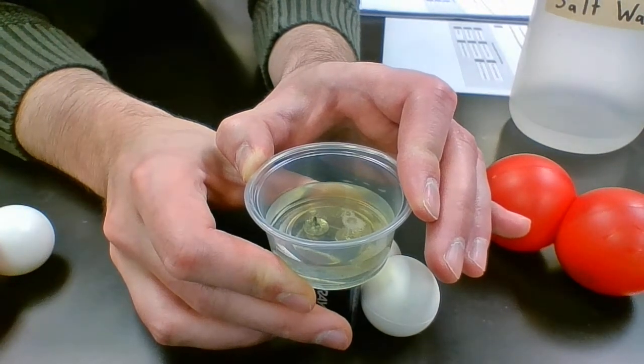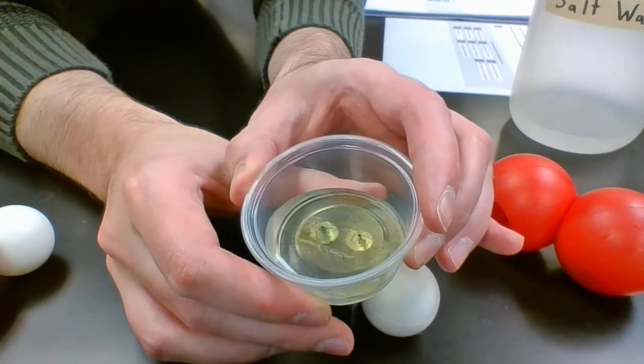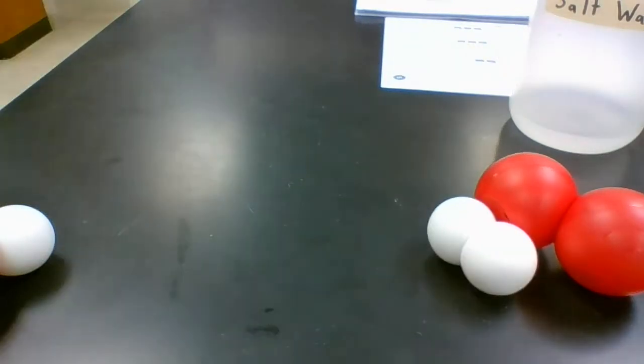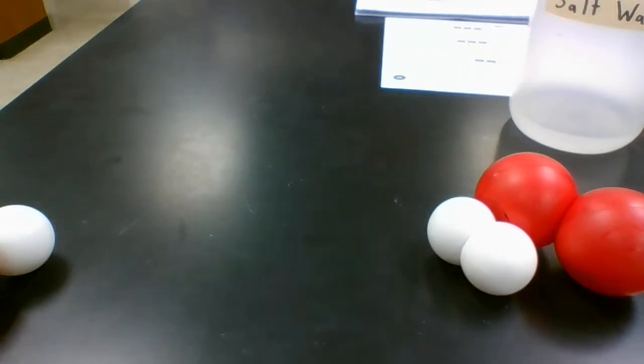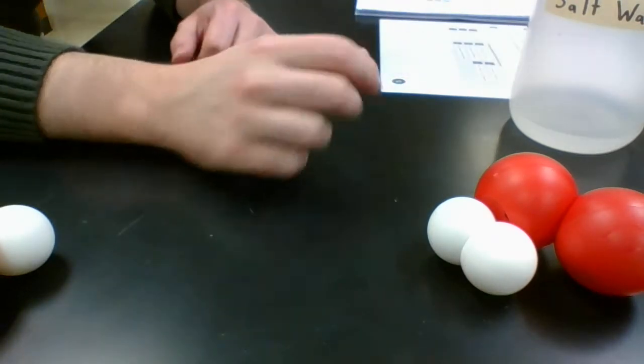So we've got a couple signs, a couple clues of good chemical change that's going on here. So that's our electrolysis model. We call that chemical reaction electrolysis.